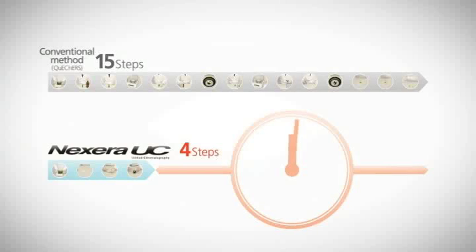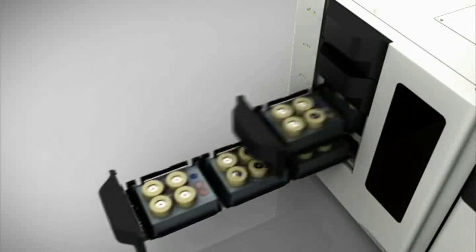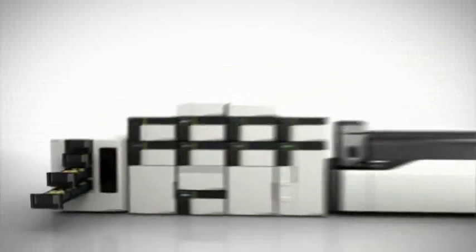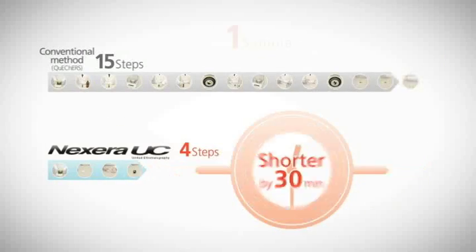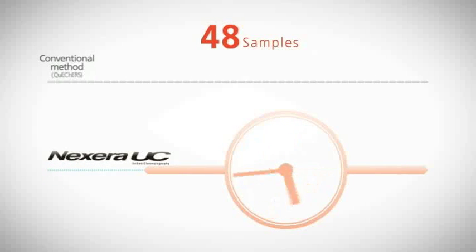For a single analysis, this can reduce preparation time by up to 30 minutes. In a high throughput environment, this time savings can be multiplied over the full 48 sample capacity of Nexera UC. Up to 24 hours of analysis time can be saved versus standard sample preparation.